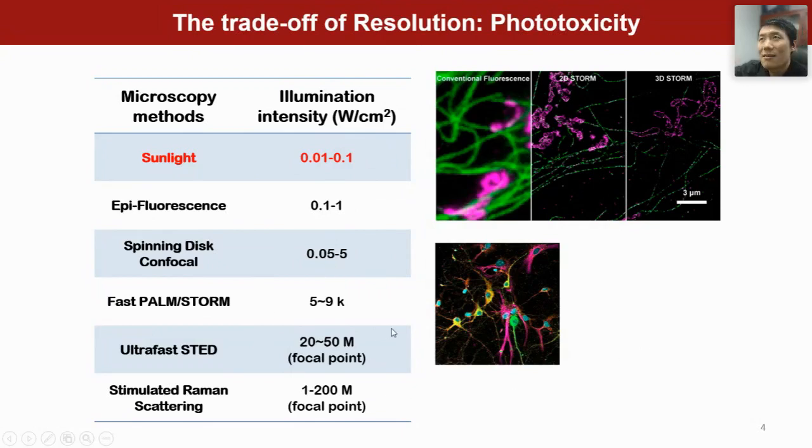I remember when I was a PhD student, I used SRS microscopes trying to capture a live cell. Maybe when I did 10 experiments, 5 times the cell got burned, while the other 5 times I got satisfactory images. But that's not really acceptable.